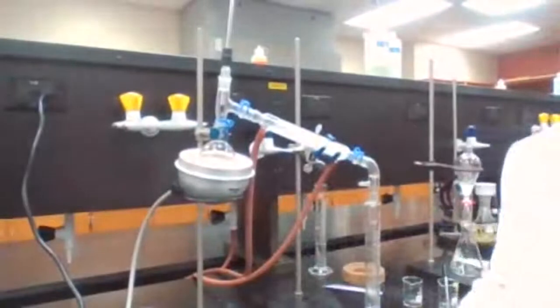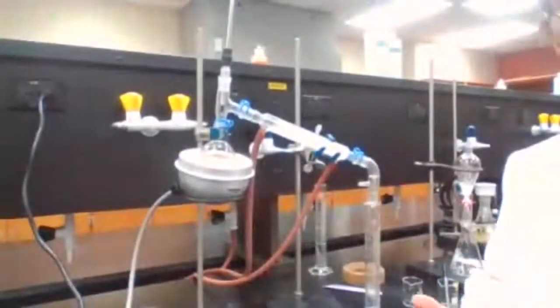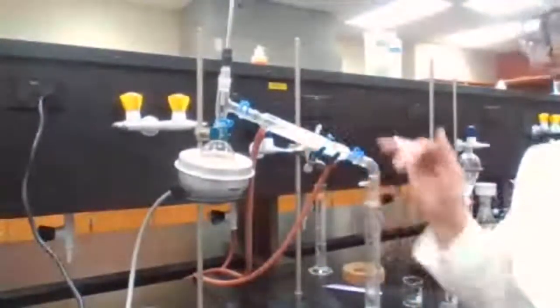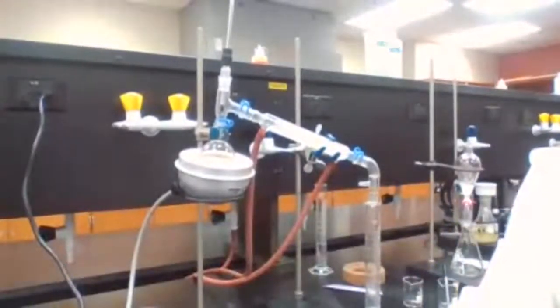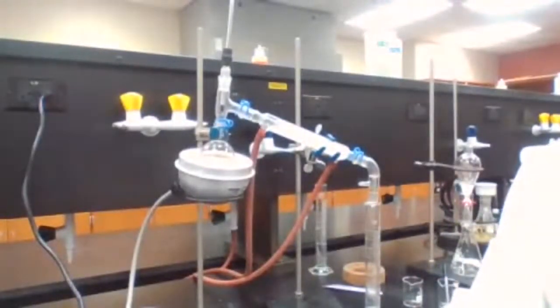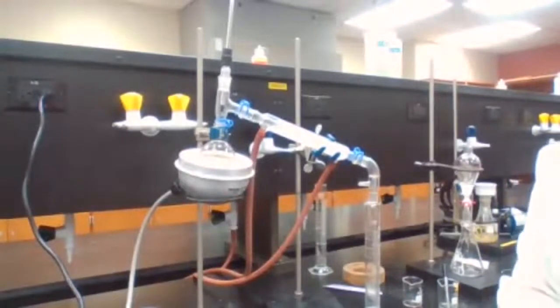I guess the connection was weak, so I had to reload it. I hope you can see now. So take a screenshot of the distillation setup. Okay, perfect.